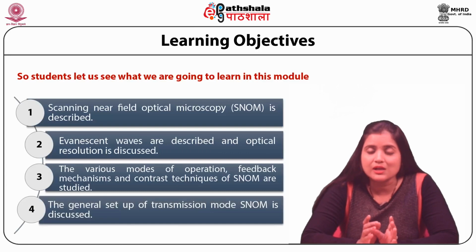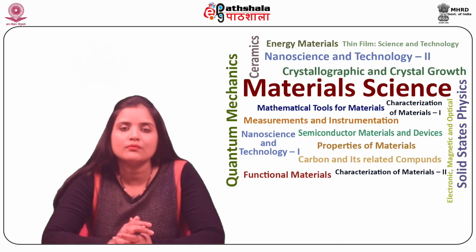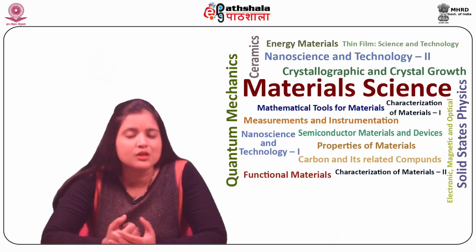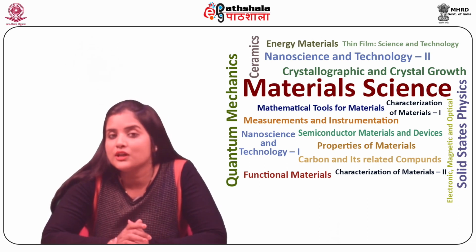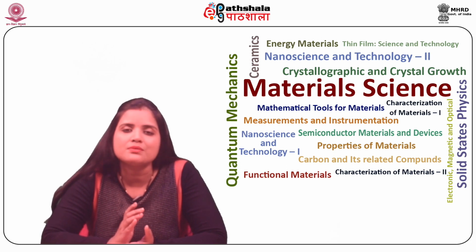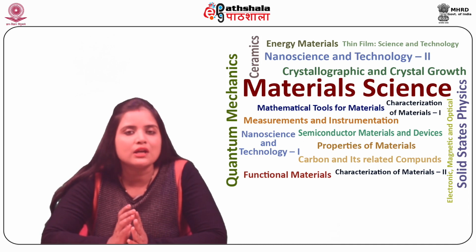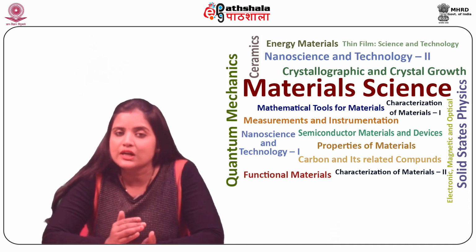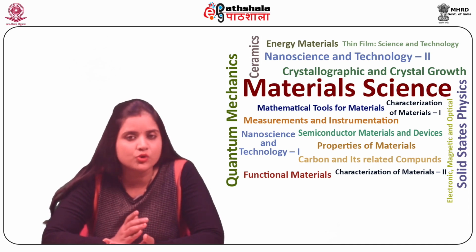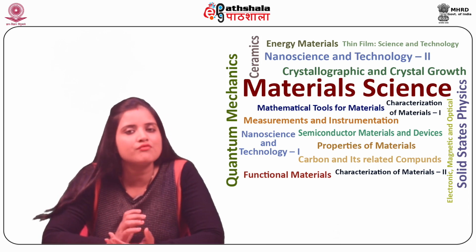Also, the general setup of transmission mode SNOM is discussed. The classical optical microscopy resolution limit was formulated by Abbe in 1873 and it has been an insurmountable hurdle restricting features detectable by optical microscopy to about one half the wavelength of light.